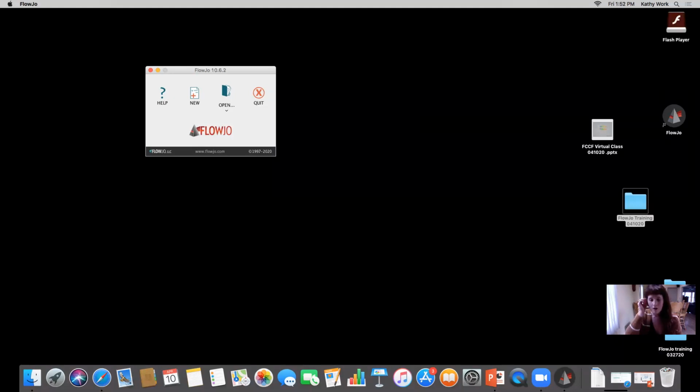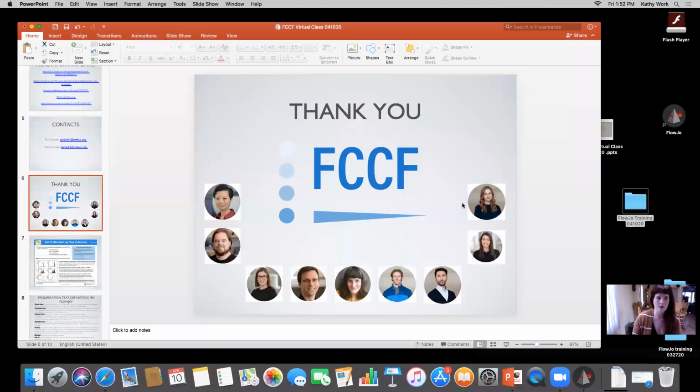Okay, thank you. So before we do the proliferation and actually bring the samples in, I'm just going to briefly show you 2 or 3 slides, just to show you some common tips for proliferation, and I'm also going to show you some of the stats that we're going to be seeing and what they mean. And remember, we're going to be distributing these slides to everyone who registered to this class.